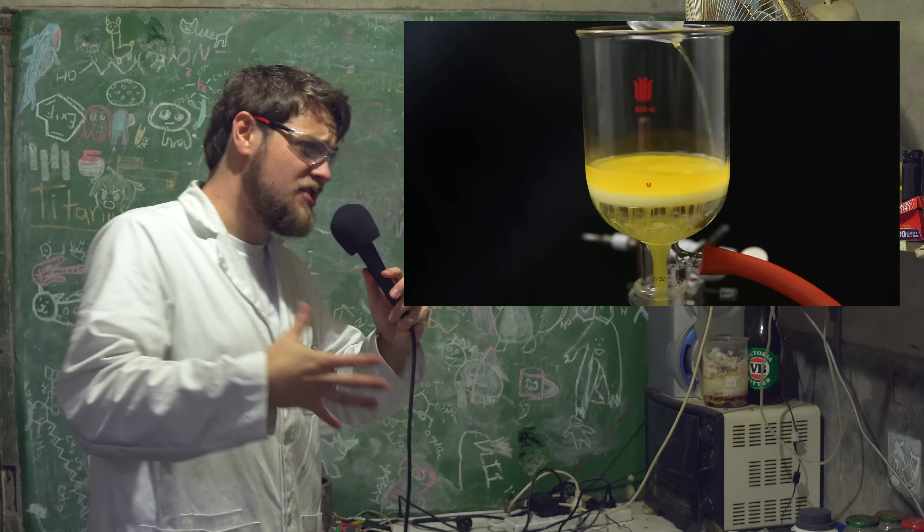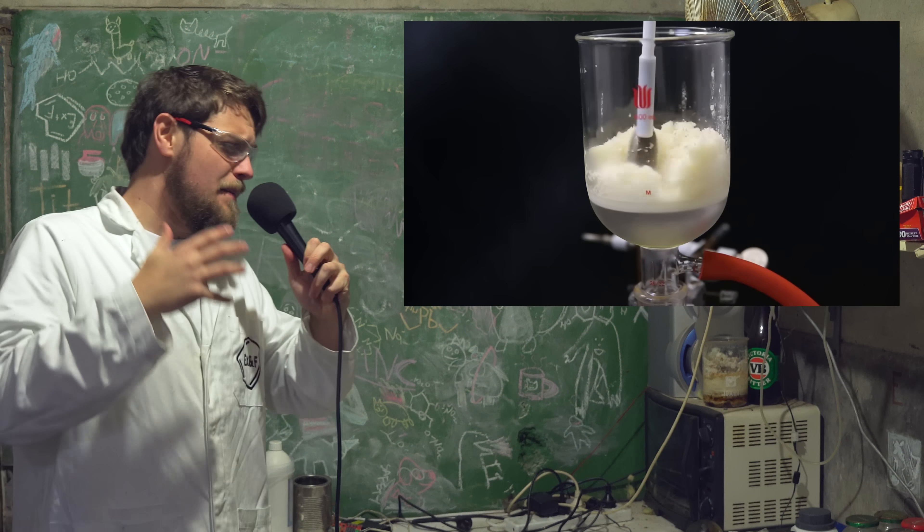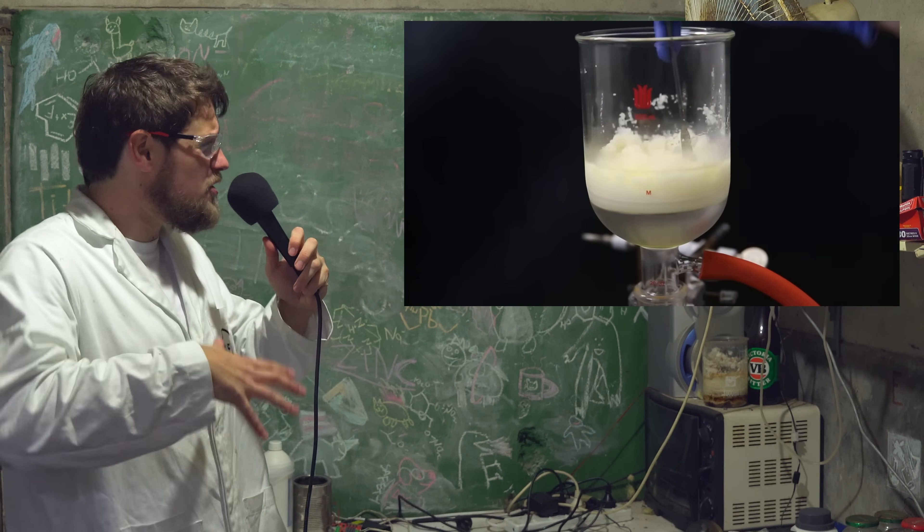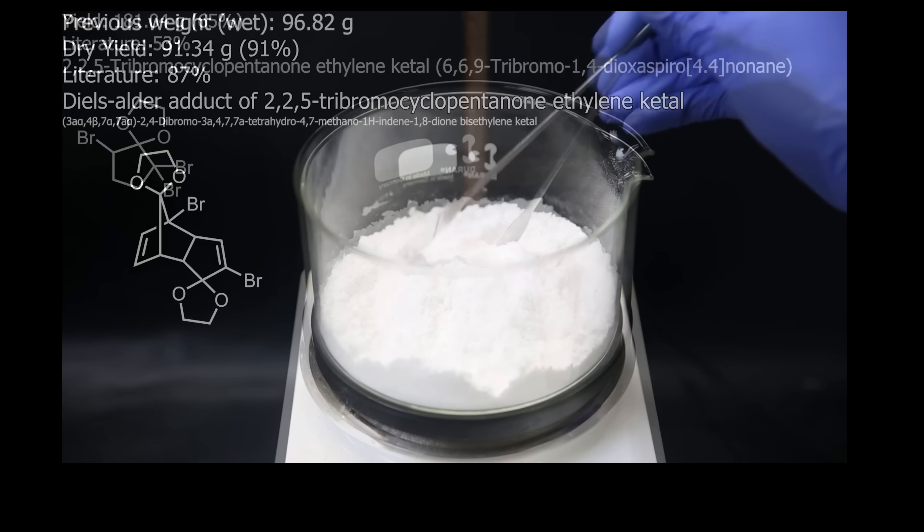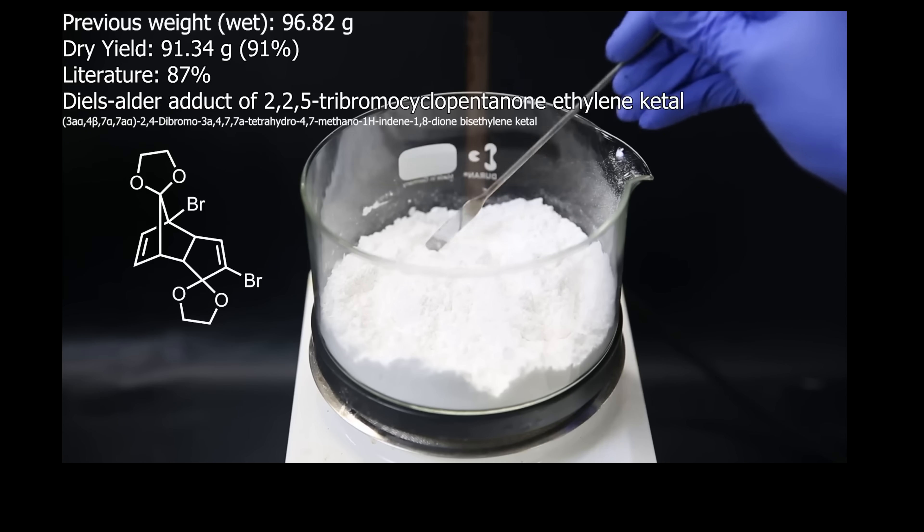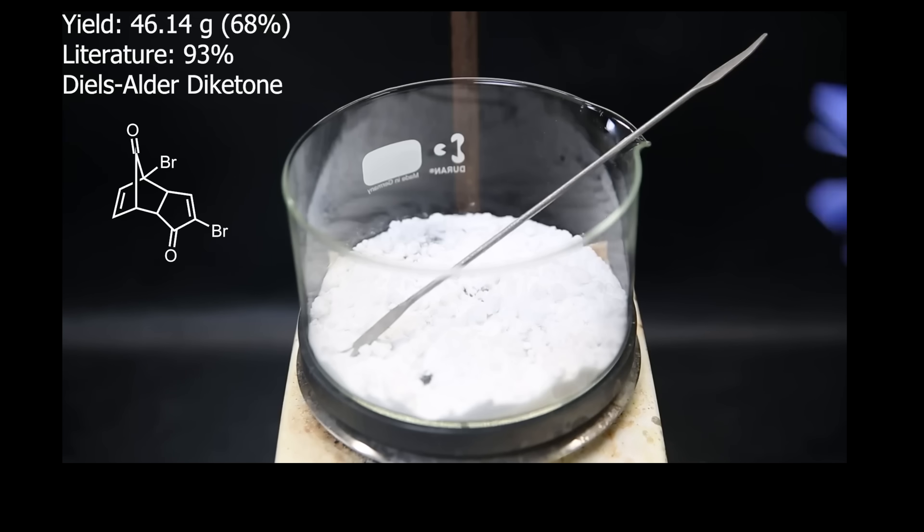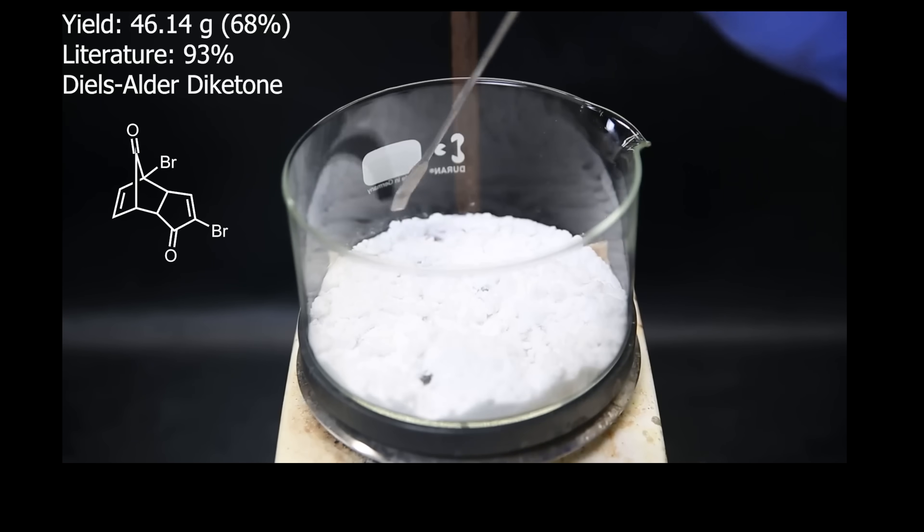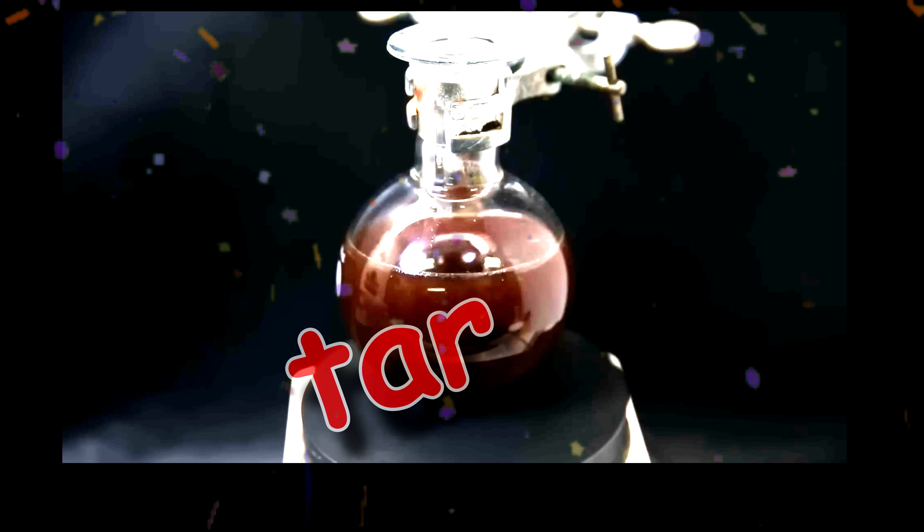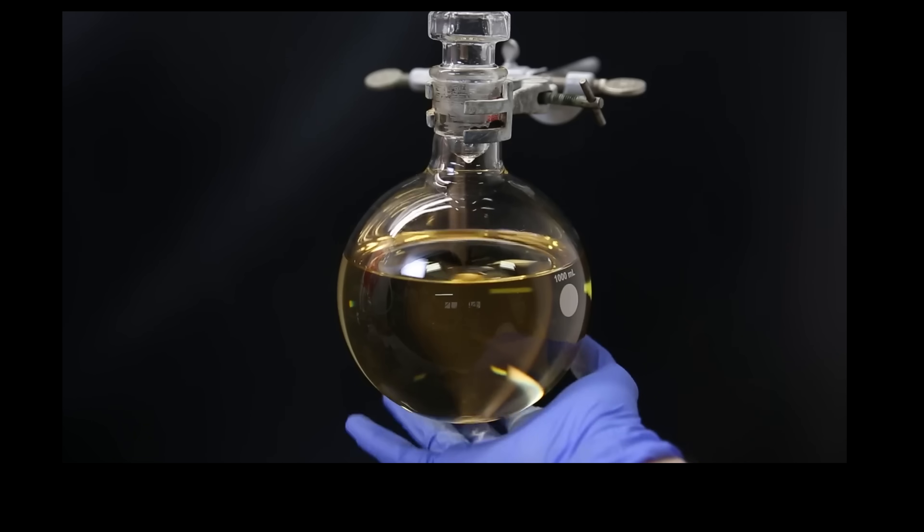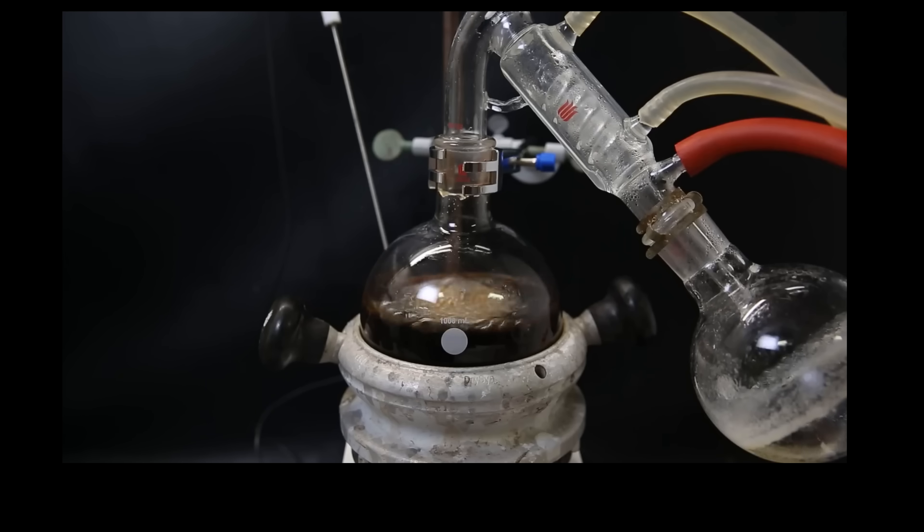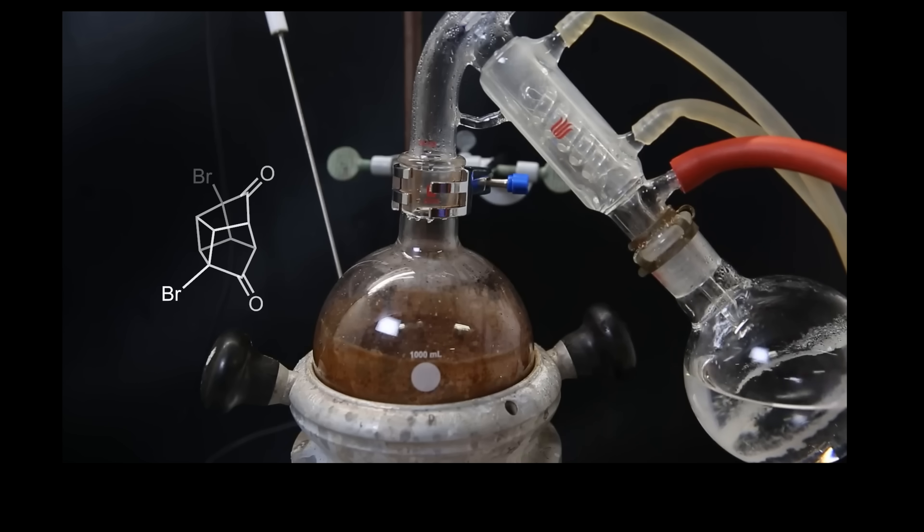Kamolius runs this on such a large scale, which is very impressive, and two things really stand out to me. The first one is that these products all look very good. It's amazing how good he's managed to get his products to look after a bit of purification. And the second thing that really stands out to me is how bad some of the reactions look. Even though he makes the products really nice, the reactions still tar up and go yellow. There's no avoiding it. There's just inherent tar.